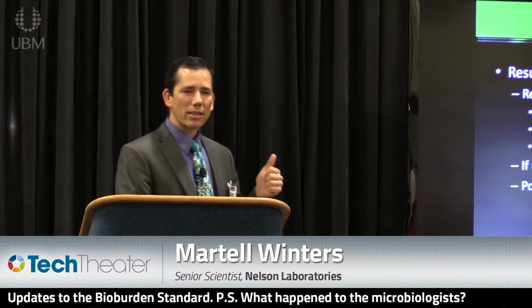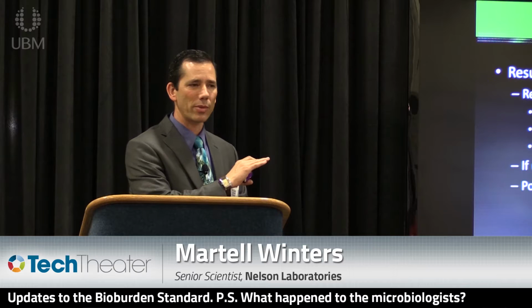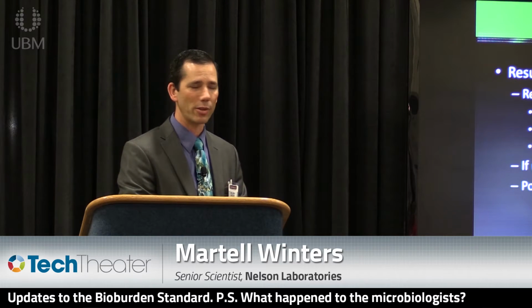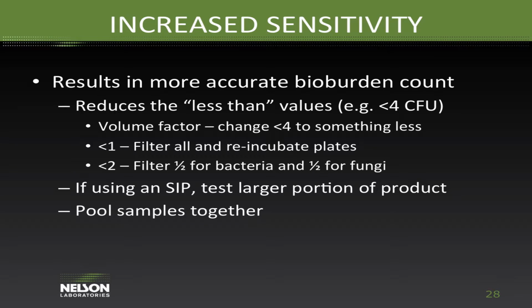An SIP is not something that's done very often, but sometimes that can really decrease the sensitivity of a test. If you're only testing 10% of your product, then no matter how much of the solution you're filtering, you can't resolve any better than 10. So if you're getting 0s, you're going to get less than 10 CFU. So if you're testing an SIP, it's easy to test a larger portion of your device. And then pooling samples can also give you better sensitivity, and I've gone through that already.